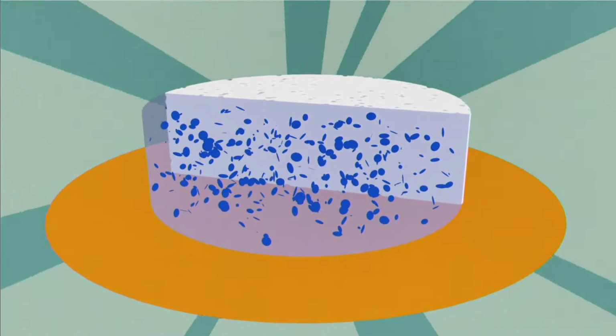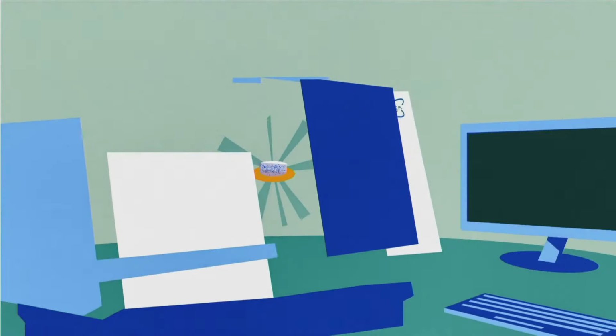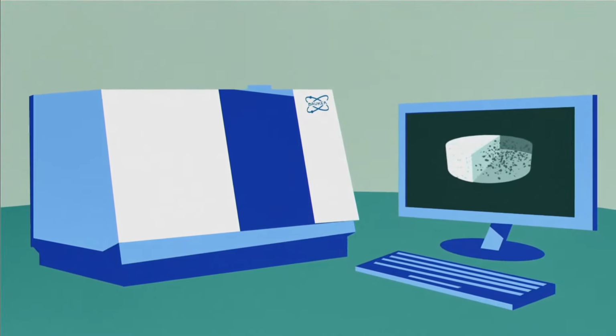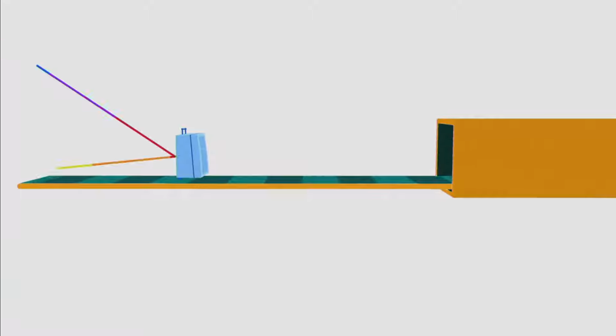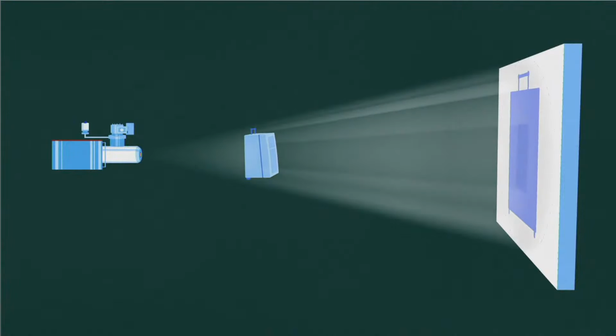X-ray microscopy is an emerging method which allows researchers to do just that. Based on a technology called microcomputed tomography, XRM combines three-dimensional imaging with advanced visualization and 3D evaluation tools. X-ray radiation is a very high-energy light capable of penetrating objects that are opaque to the visible spectrum. Cone beam X-ray imaging results in a two-dimensional radiograph, showing the transmission of X-rays through an object. Low-density volumes of the object allow high transmission, while high-density volumes allow low transmission.